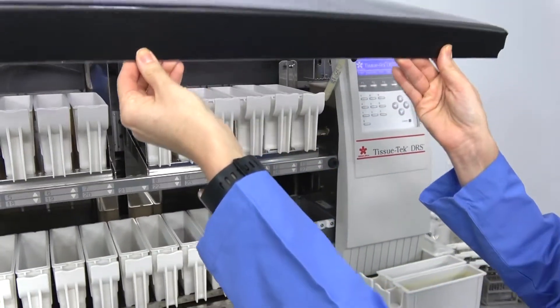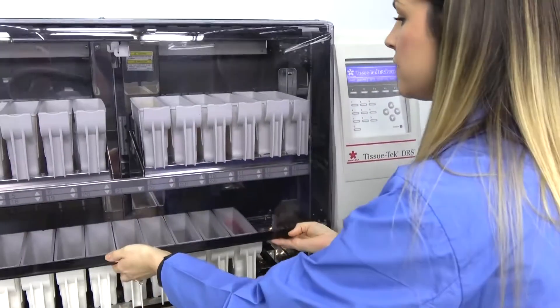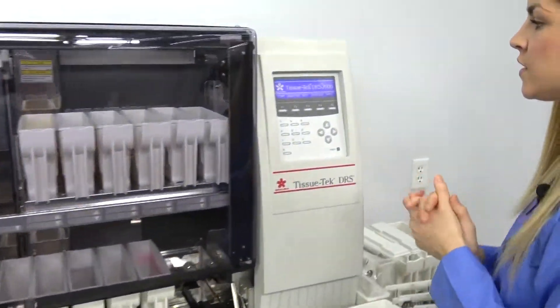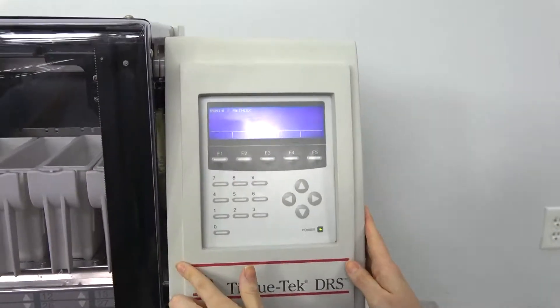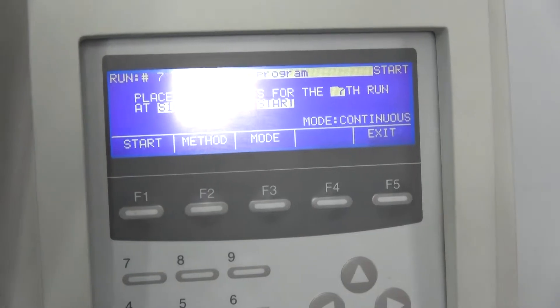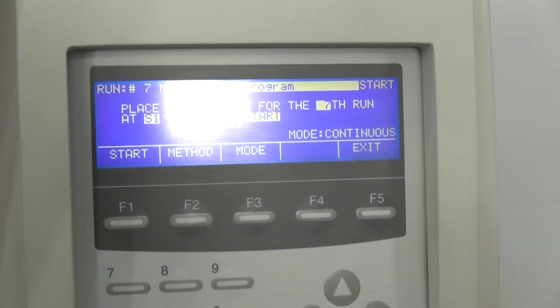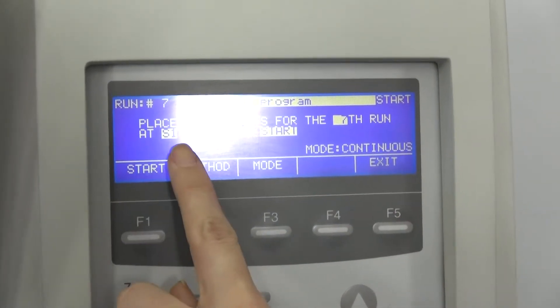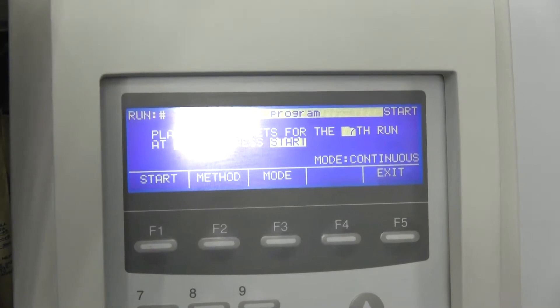Okay, I'm going to show you how to run this unit. So like I said this is very user-friendly. We are just going to hit the start button and we have already selected the NLS program and this is going to be our seventh run of the day and we are going to start at the S1 slide location.